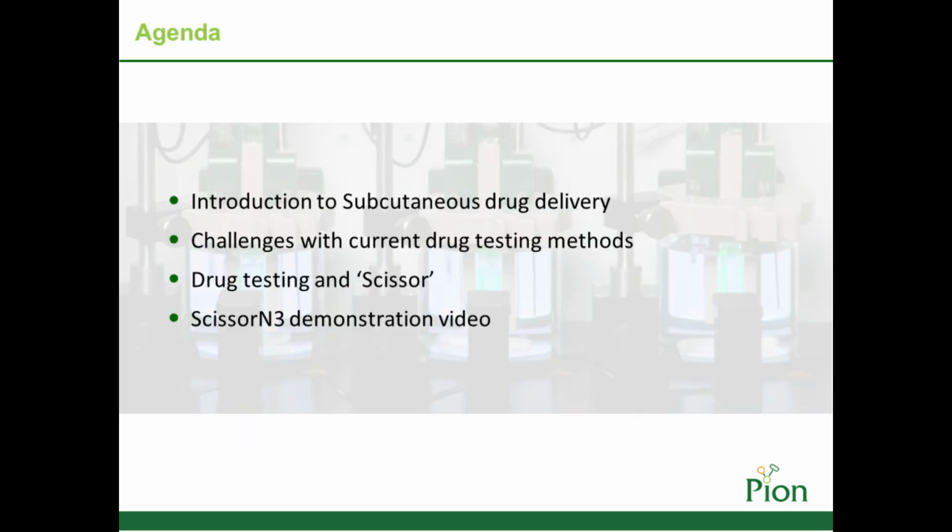In today's session I'll give a bit of an introduction on subcutaneous drug delivery in general and the challenges with current drug testing methods, how we use the SCISSOR platform to tackle some of those challenges, and a short demonstration of the SCISSOR N3 in action.